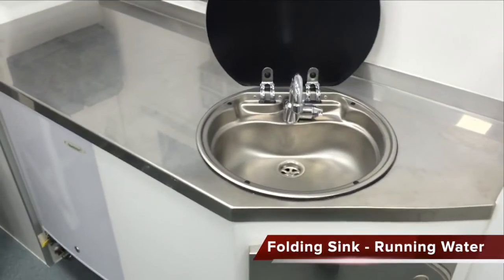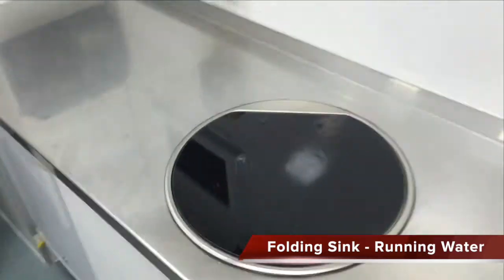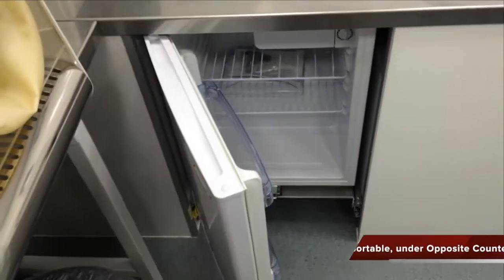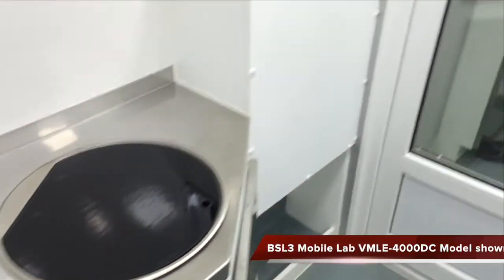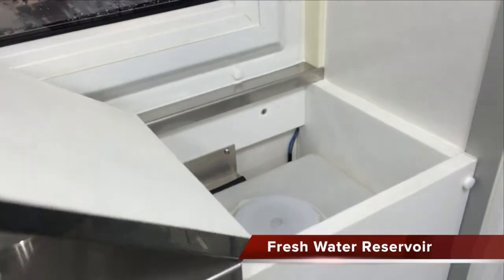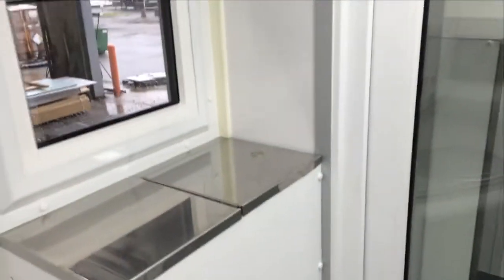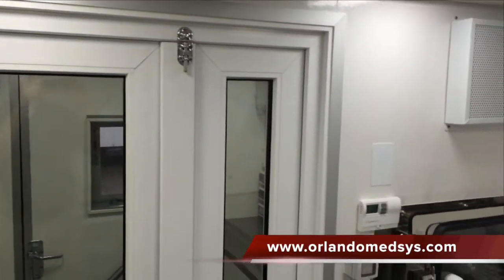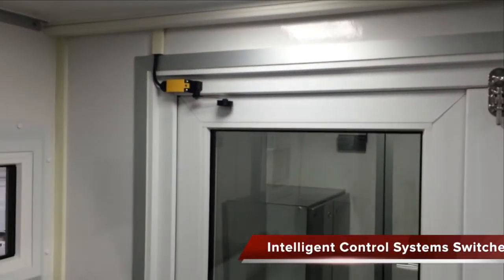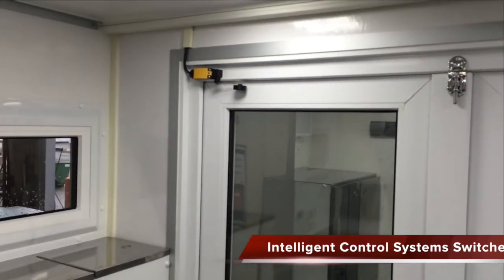Down here we have a folding sink, stow away. Refrigerator for storage. Our water tank storage — this is for the interior sink water. You can see the HEPA system, and the HVACs are run by the door switches interior. It all keeps the proper negative pressure in the right room and keeps the air conditioning running in the correct room.